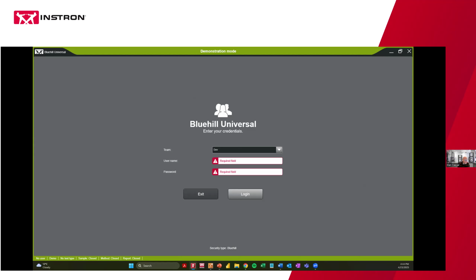Okay, next question says, hi, when I am logged in, can I see the other users who are also logged in at the same time as me? Is there a chat box to communicate? So quick answer is no.